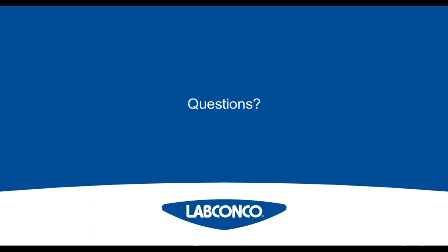Your next question is, how does EndZone endpoint detection work? With our EndZone endpoint detection, like we talked about in the webinar, the whole idea behind it is to alert you when your freeze-dried samples in a flask are dry. The way that it does that is the EndZone kit comes with two vacuum sensors. One goes into an empty port on your manifold. The other goes into a port on the top of your sample.